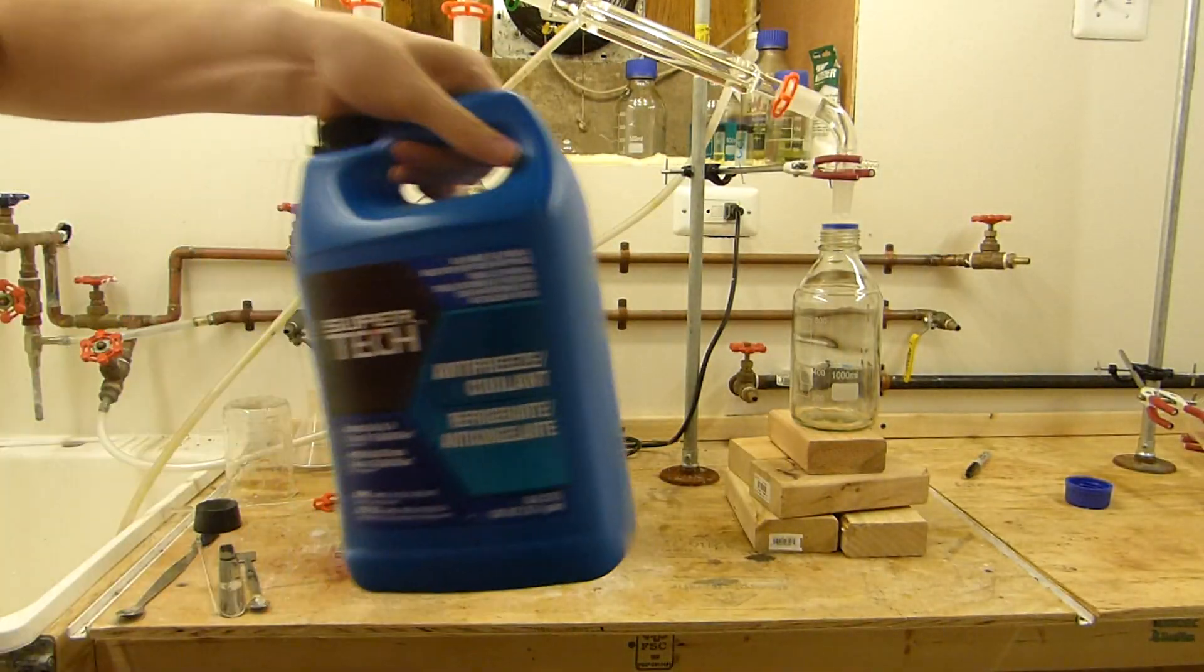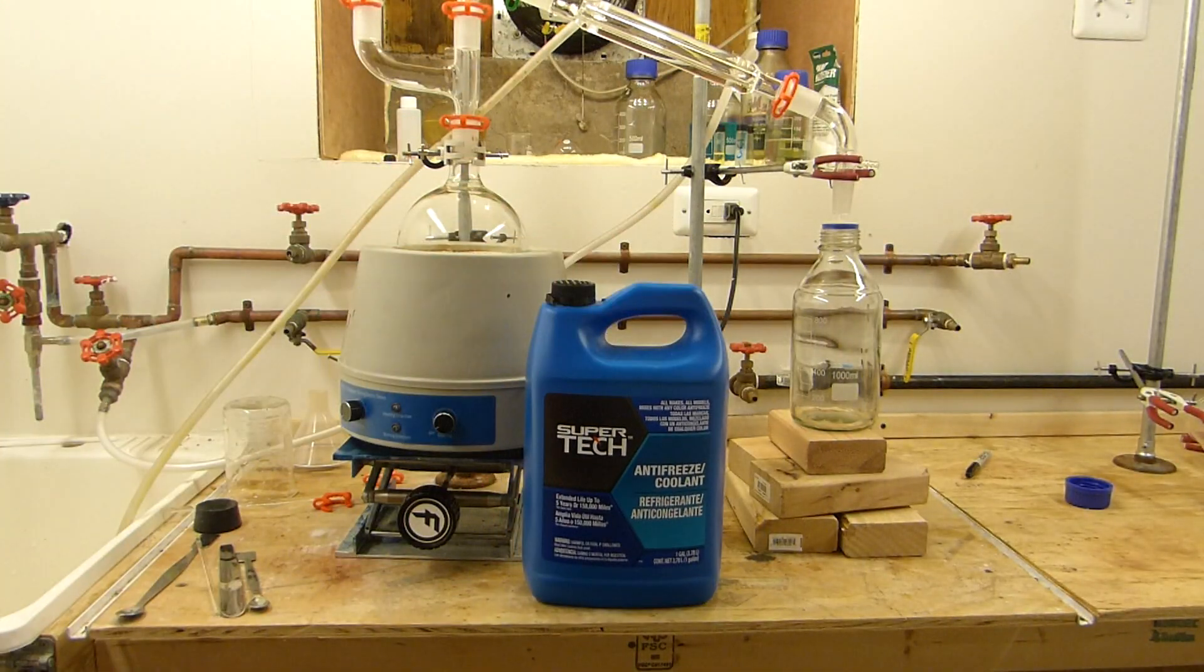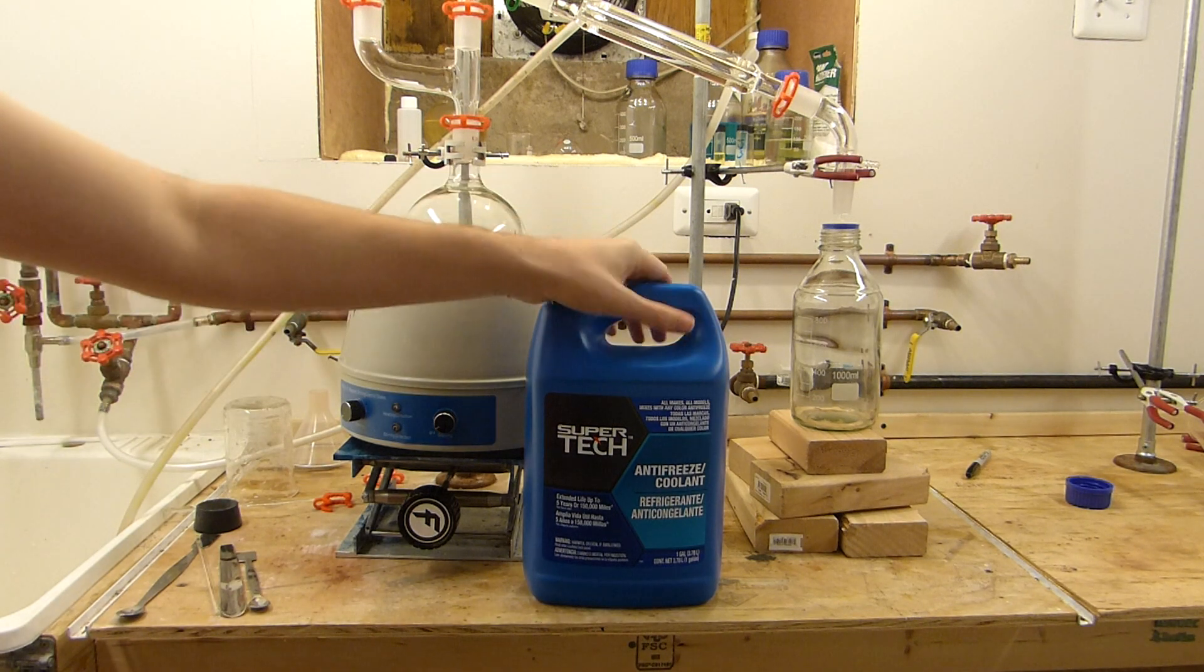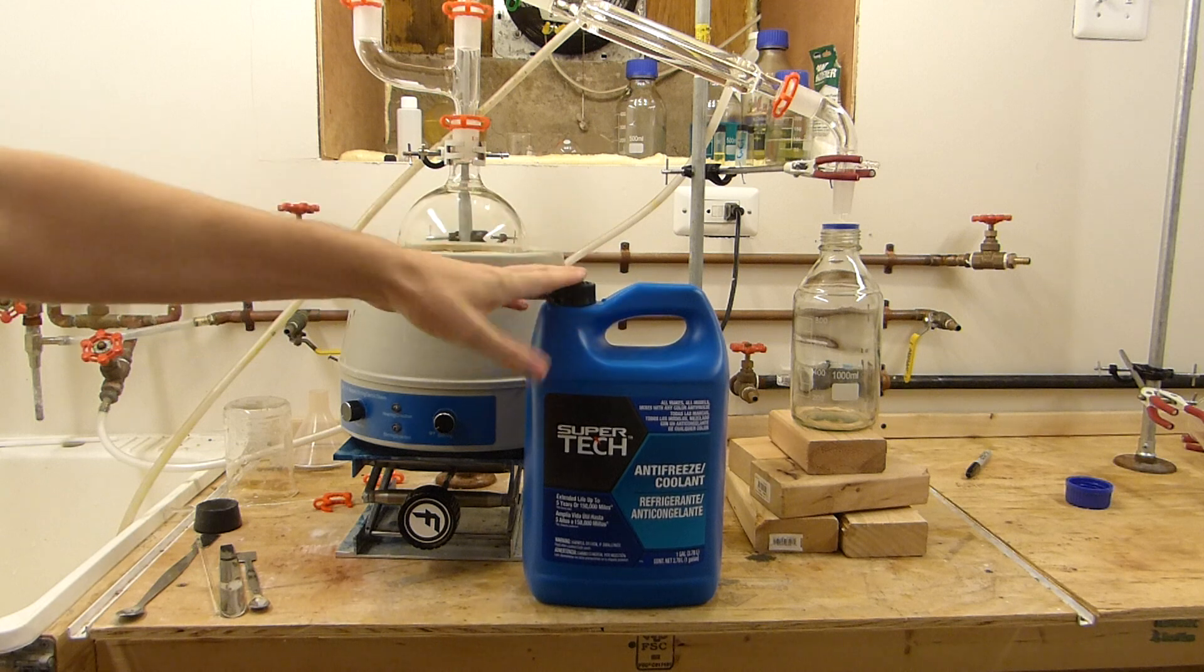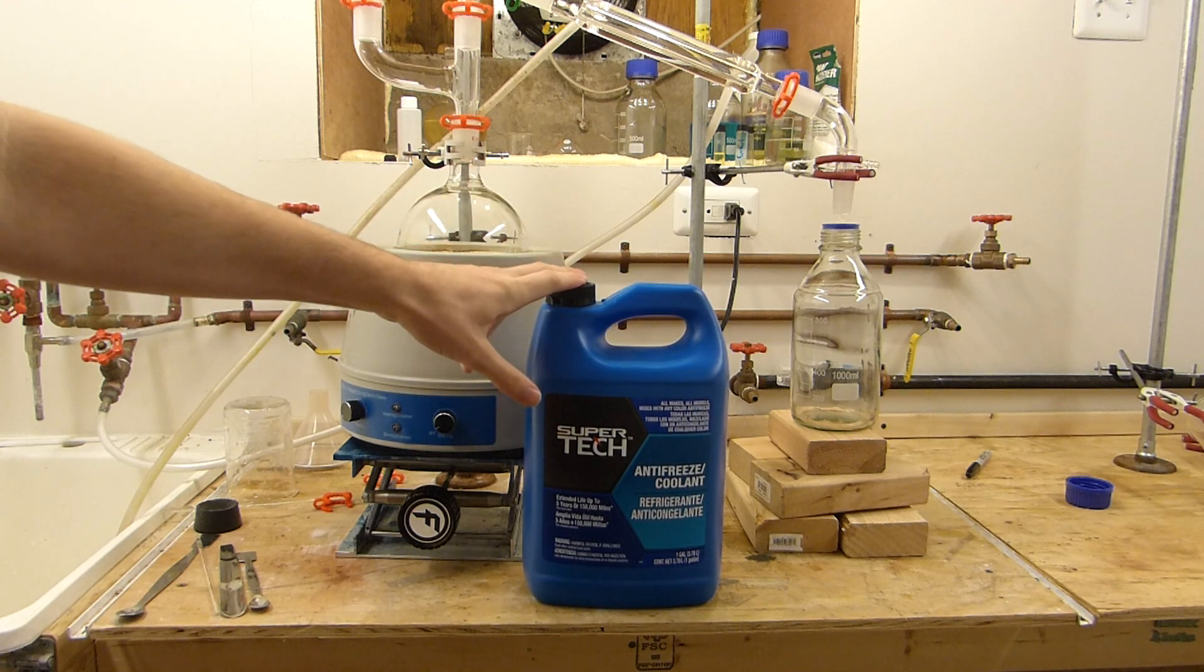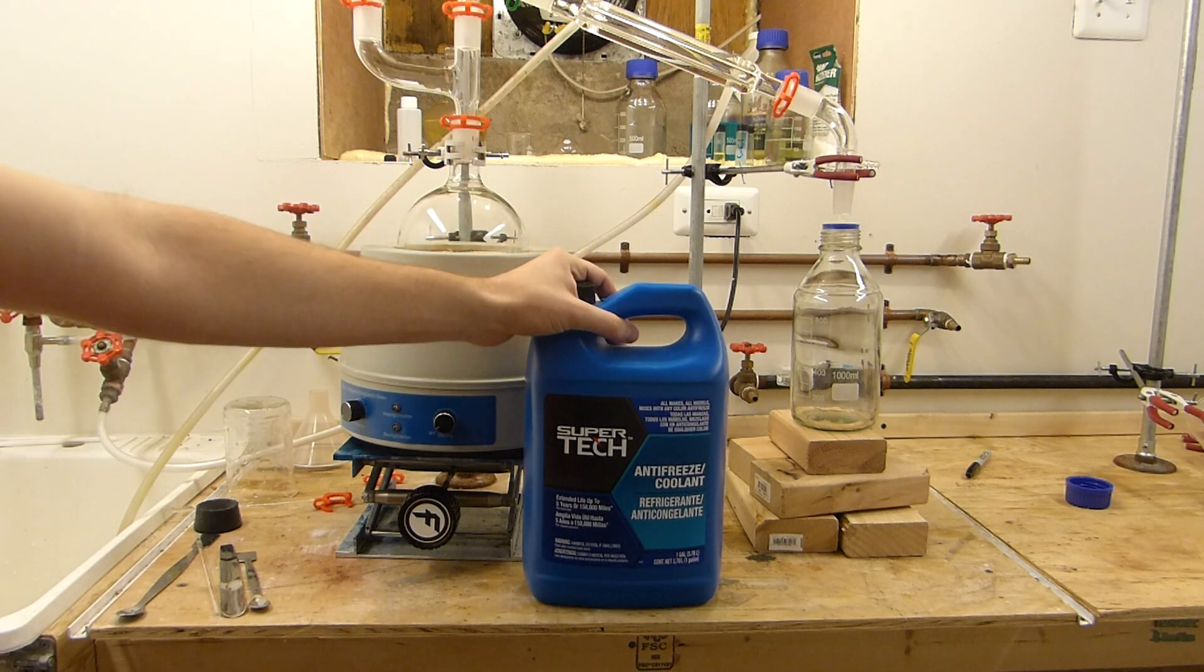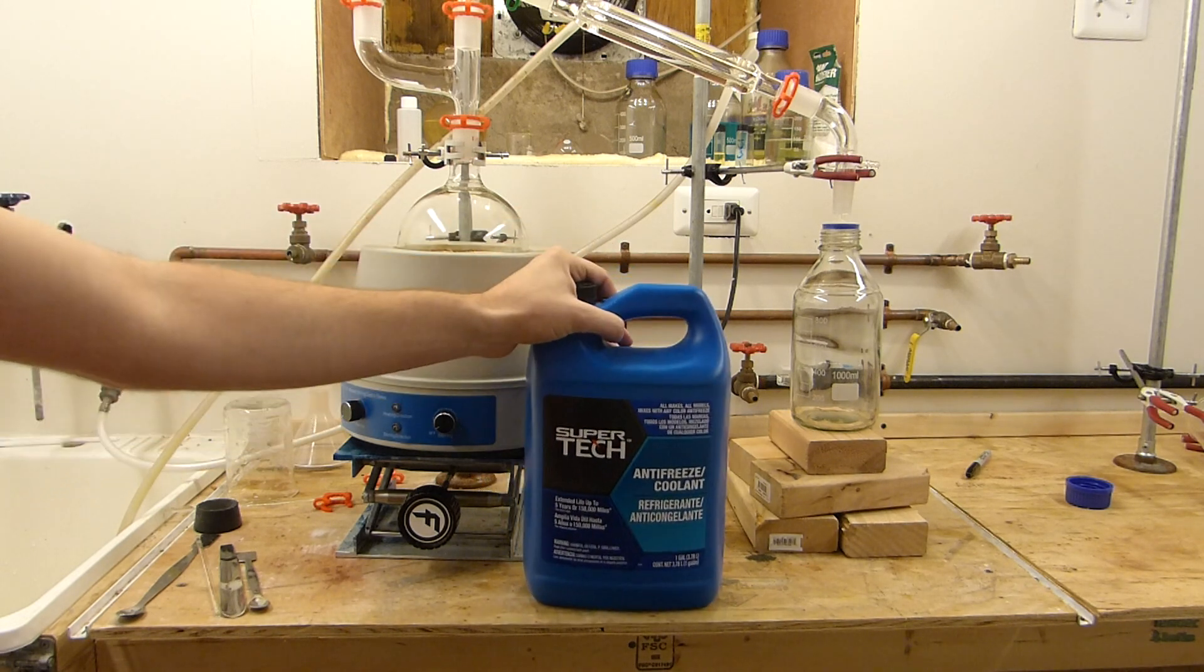If you look up all those components, you'll find that ethylene glycol has the lowest boiling point out of all of them by about 40 degrees. So we should be able to easily distill the ethylene glycol out of this antifreeze. If you also look at the MSDS, you'll see that almost 90% of this is ethylene glycol. So it's a very good source and it's also very cheap. I think this was seven dollars.